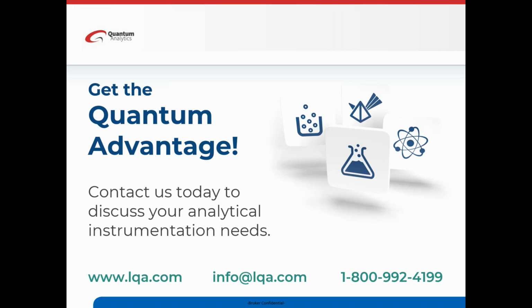So the answer is, they're not always perfect, and when you can do your own libraries, it's optimal. Sometimes the second hit will be best, or the third, or the fifth, or the 10th. So you actually need to look at them. And during our training for our customers, we talk about spectral interpretation at great length to help you develop your own methodology for getting the right answer.